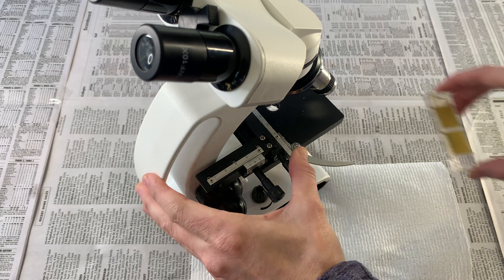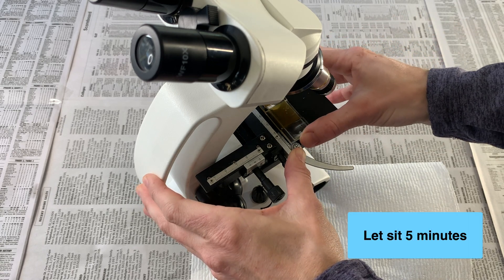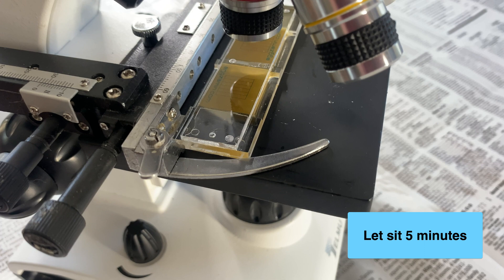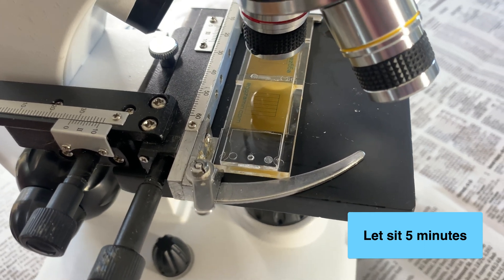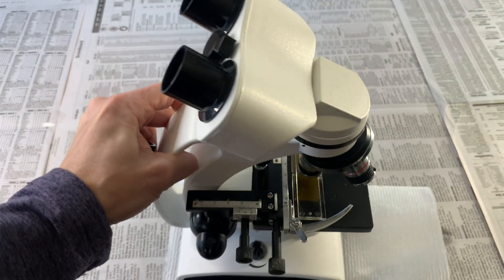Immediately place the slide on the microscope and let it sit there for another 5 minutes. During this time, the parasite eggs will float to the top of the saltwater solution within the slide chambers. After waiting 5 minutes, it's time to study your sample.